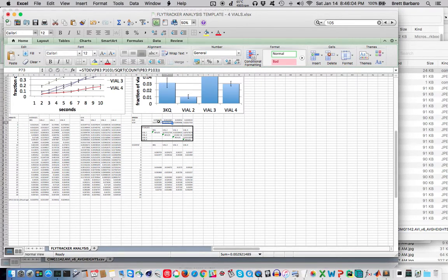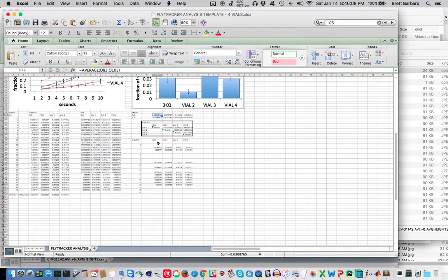Over here, it calculates the average speed as the average over all of these that you see down here. And they should be identical, because no matter how you calculate it, the numbers should be the same. And in this case, they are identical, so that works out. And here are the p-values, and I think that's all you need to know.